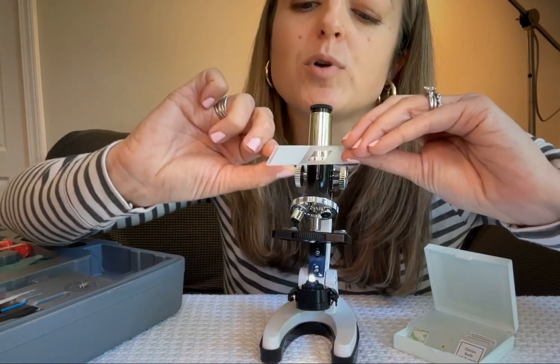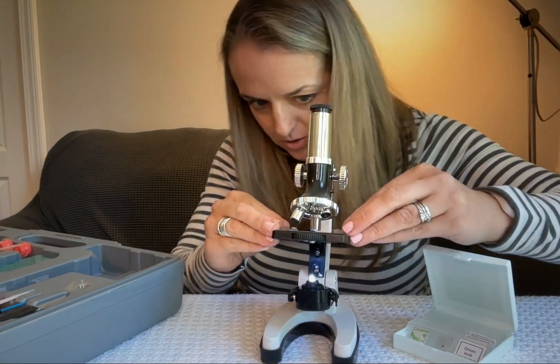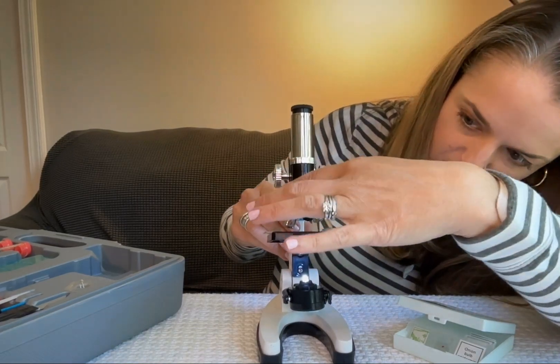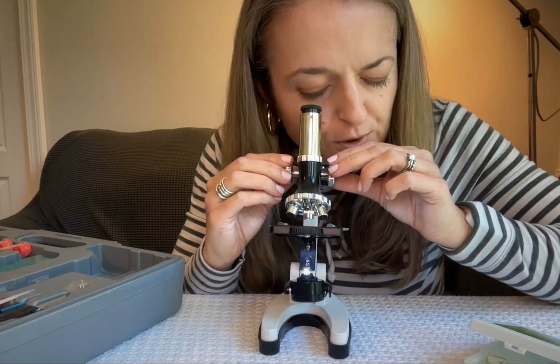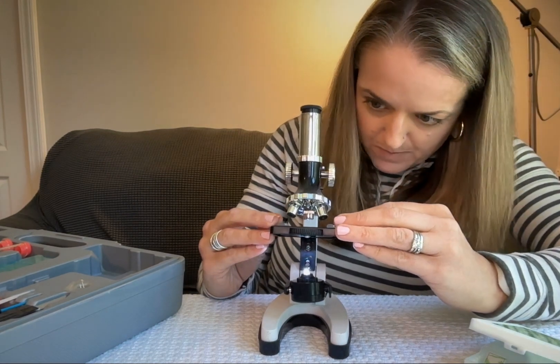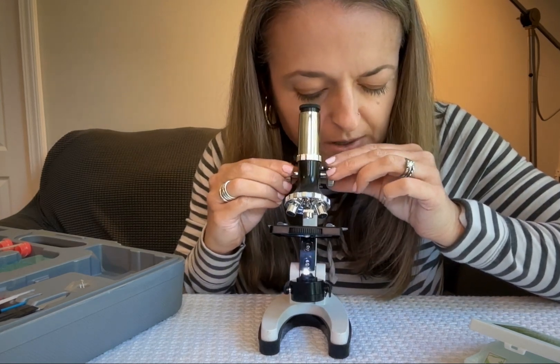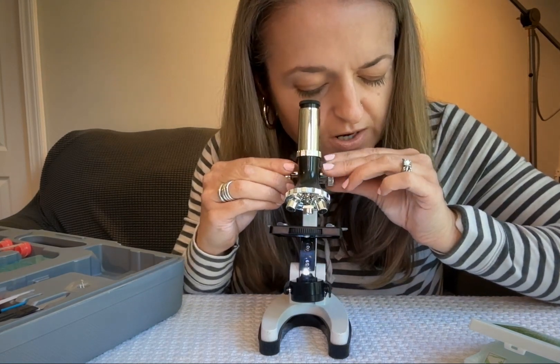I'm going to use a prepared slide — this one is the broad bean leaf. I'll set it in here; we've got little plastic arms just like you're used to seeing that are going to hold it in place. You can rotate to get different magnification levels. It's always good to start further back and then bring it into focus before you magnify it even more. The dials on the sides help you bring it into focus so you can see your very cool stuff.